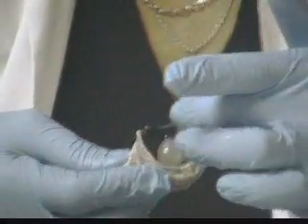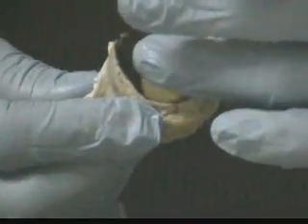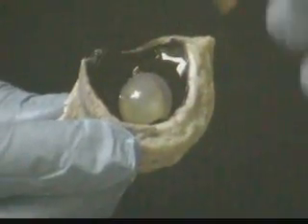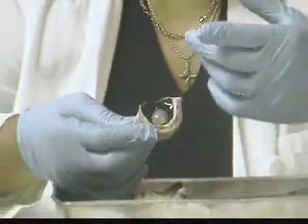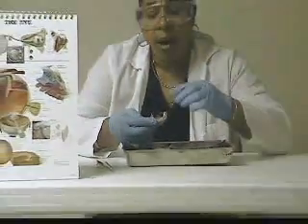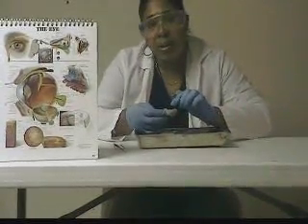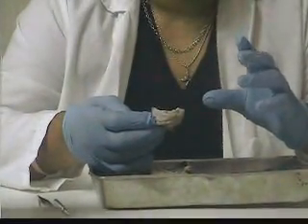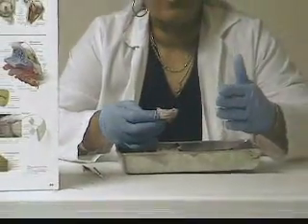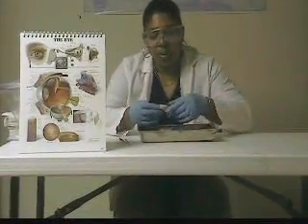This dark or pigmented area of the eye is known as the choroid — that's the second tunic of the eye. It is also the vascular tunic, meaning it has a blood supply and a nutritive function. Anteriorly, the choroid forms the iris of the eye. The iris is discontinuous, meaning it doesn't fully cover the entire eye, and that allows for the formation of the pupil. Right here you can view the pupil — it's that opening there.